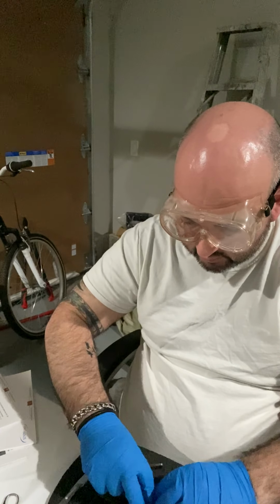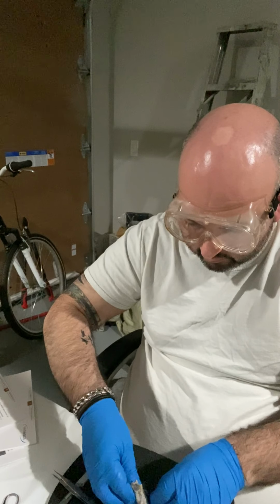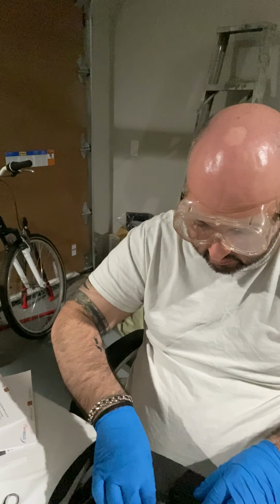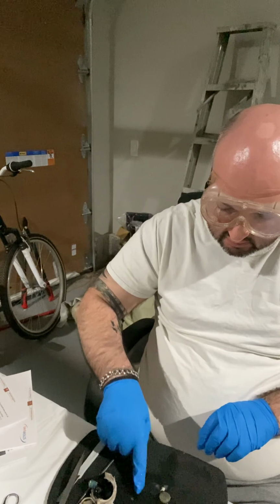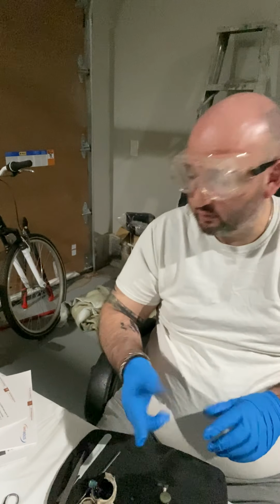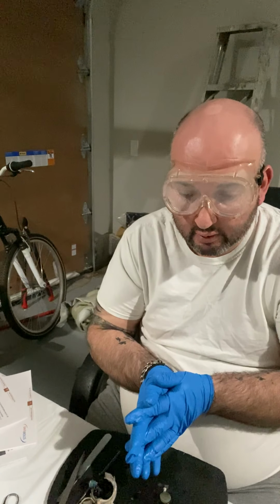So it's not separating very easily, so I'm going to have to turn the eyeball inside out to make things happen. Hopefully you can see this. This is my vitreous humor back here. It doesn't really feel like much of anything, just like jelly, honestly. It has the texture, the feeling of jam that I would spread on my bread, I mean, on toast, really.